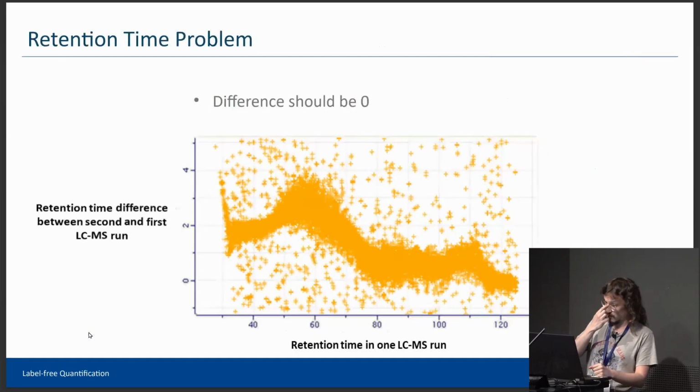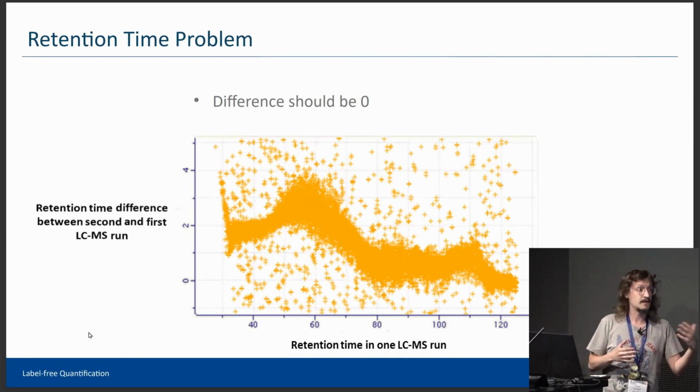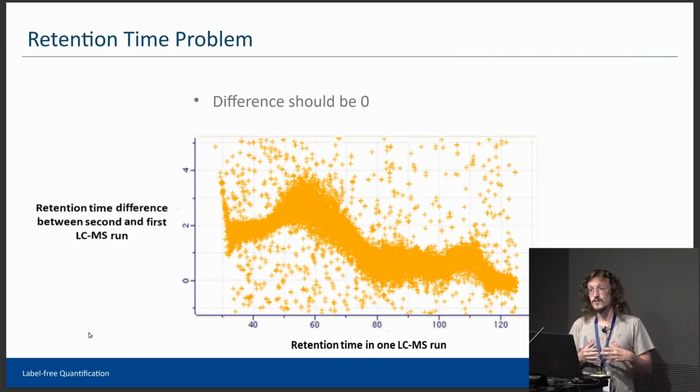So how to solve these problems? All these things that I will show you right now are already done in MaxQuant. You can tweak the parameters to change things, but usually when you select Max LFQ, the software will take care of all of this already.